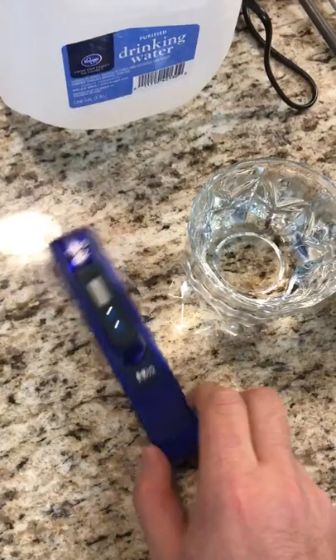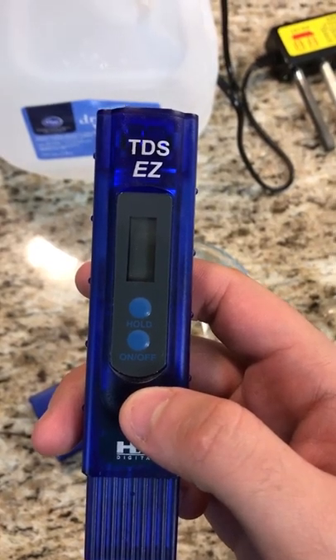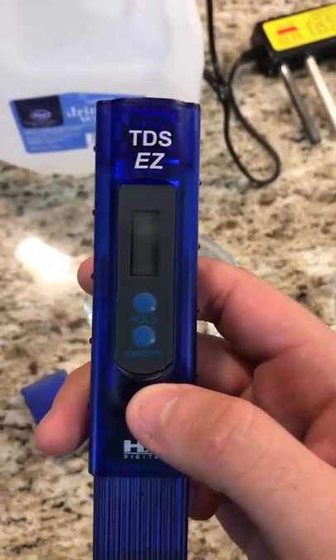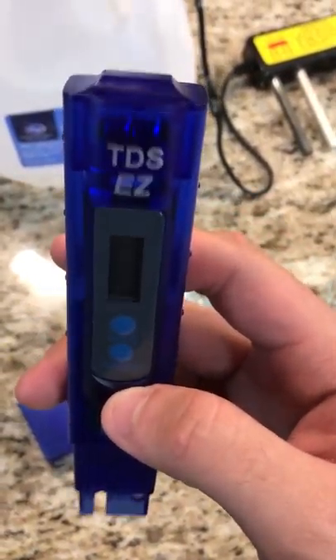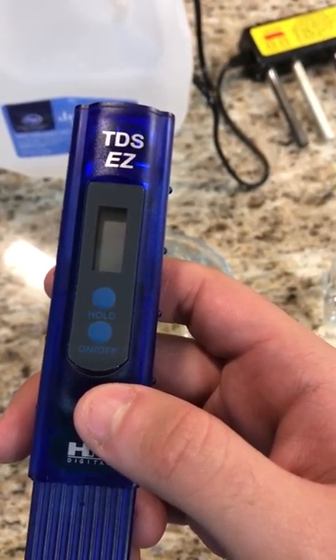The first part of this video is going to show the Total Dissolved Solids of the water. We have a TDS meter here — you stick it in the water and it will tell you the total dissolved solids in the water in parts per million.